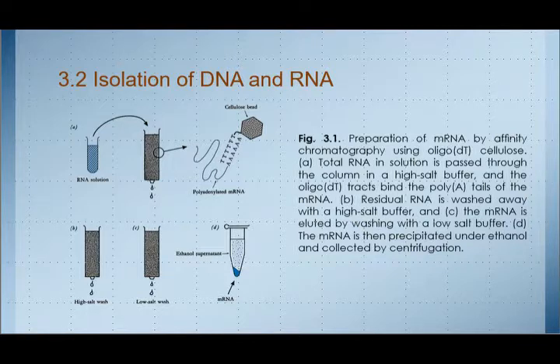Over a long period, up to 48 hours in some cases, a density gradient is formed and the pDNA forms a band at one position in the centrifuge tube. The band may be taken off and the cesium chloride removed by dialysis to give a pure preparation of pDNA. As an alternative to gradient centrifugation, size exclusion chromatography or gel filtration or similar techniques may be used.